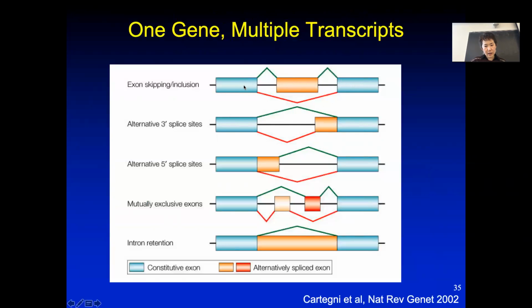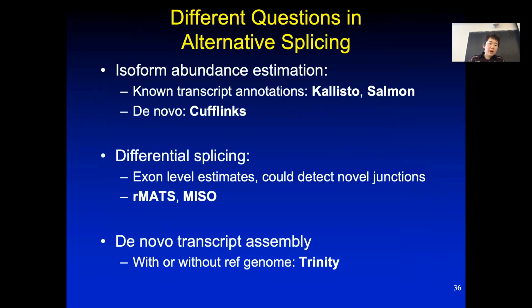It's only using exon 1 and 3, and the second one got eliminated. So very often the people who care about splicing don't do the whole transcript, because sometimes the first exon and the last exon are really far away. You don't really have the power to detect that, but you can detect whether a particular exon is being differentially spliced, and there are some algorithms for that as well.